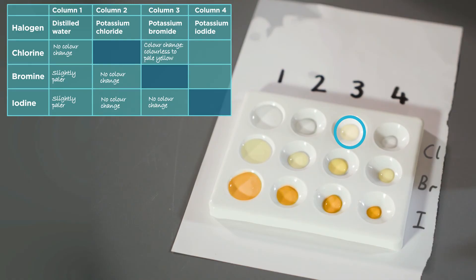The resulting pale yellow colour indicates that bromine has been produced, which means that a displacement reaction has taken place. Observe very carefully because sometimes the change is very slight. Here you can see a very slight yellow colour.